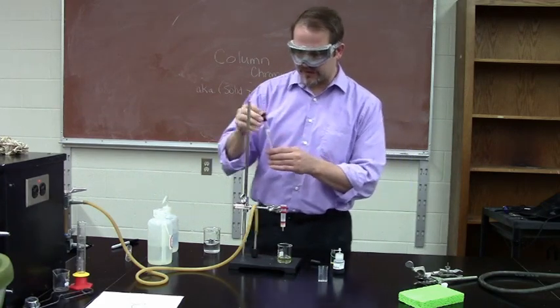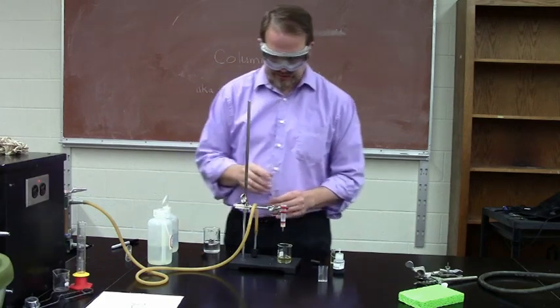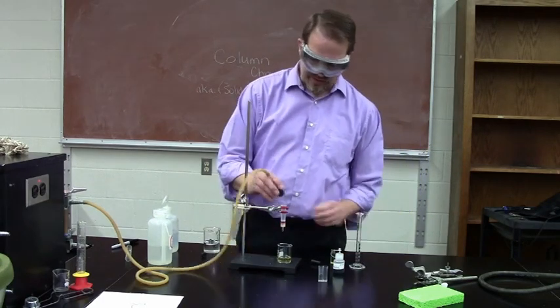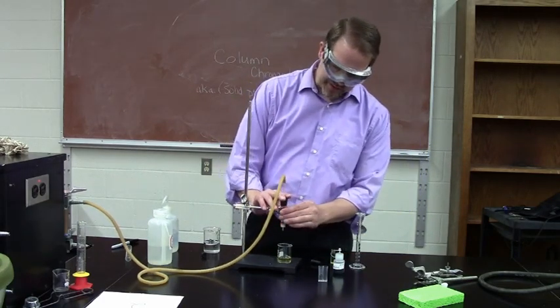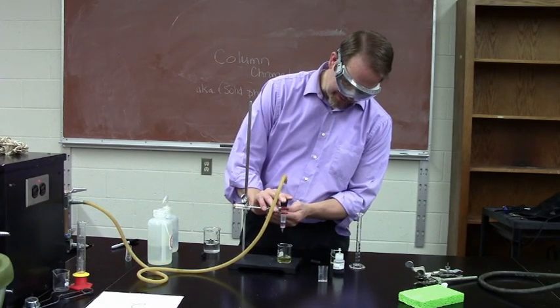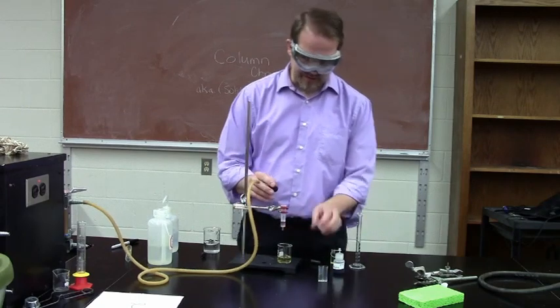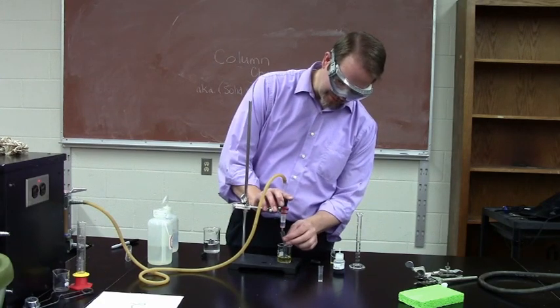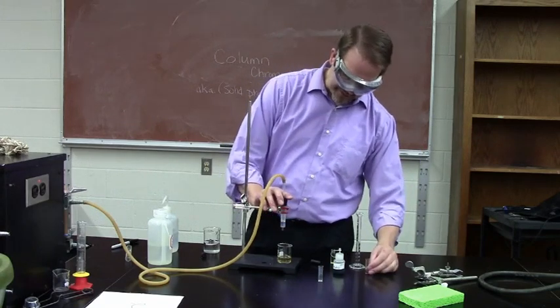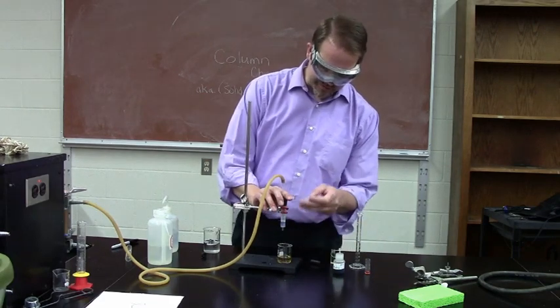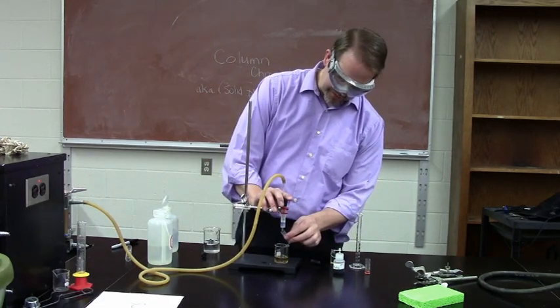Now once I've got this mixture that has some nonpolar solvent in it, I can add that to the top and I should be able to extract out the red. Okay, here comes the rest of the yellow. That might have been too much because I'm seeing the blue starting to come off. And so I think I've had too much. There's a little bit of red. So I can collect the red and it looks like I might get the red and the blue to come off, but there's the red coming off and my blue is starting to come. So I can go ahead and go right to my next. That's a good clean separation. I think I was a little lucky there.